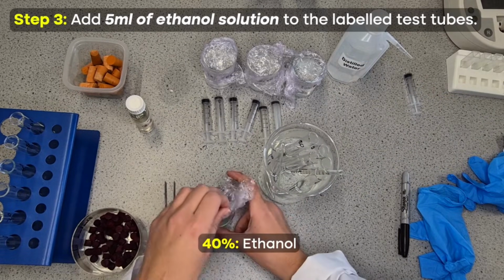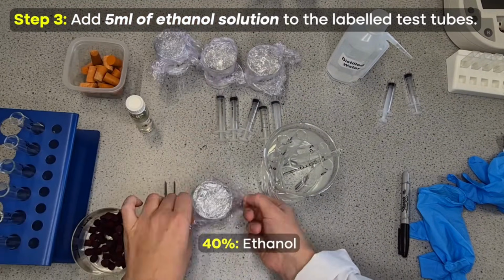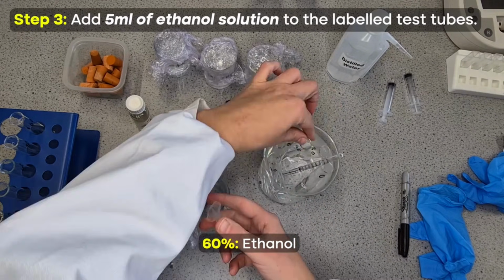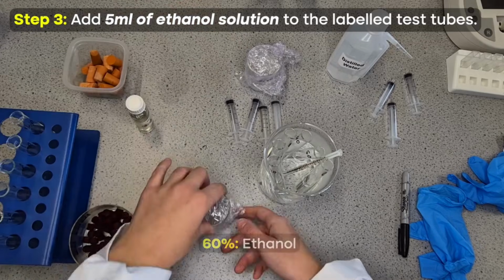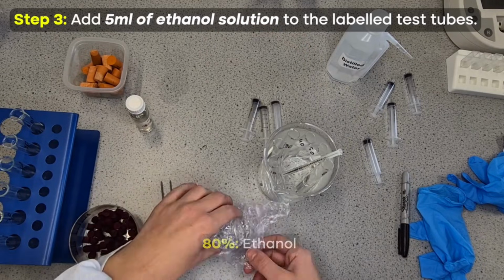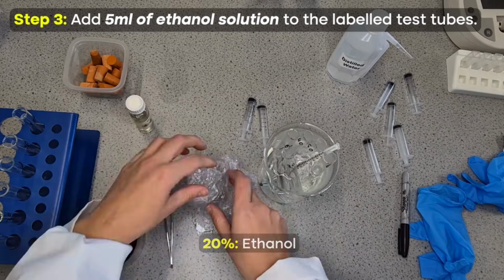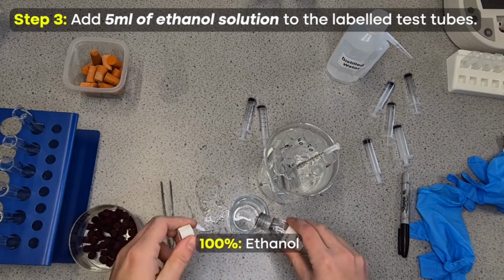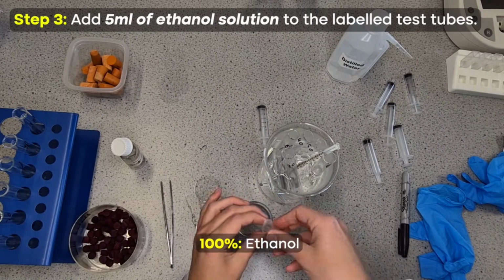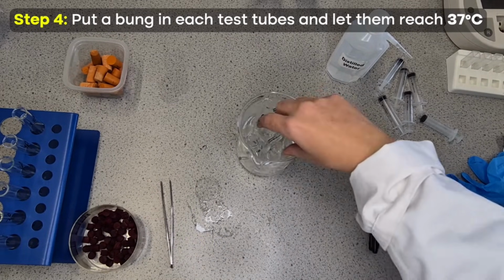We go to this one next, which is 40%. 60%. We've got 80% here. 20%. And then lastly, we've got the pure ethanol. So I'm just going to pour it into here so I can get my syringe in for the 100%. So we've got all of those solutions in there now.